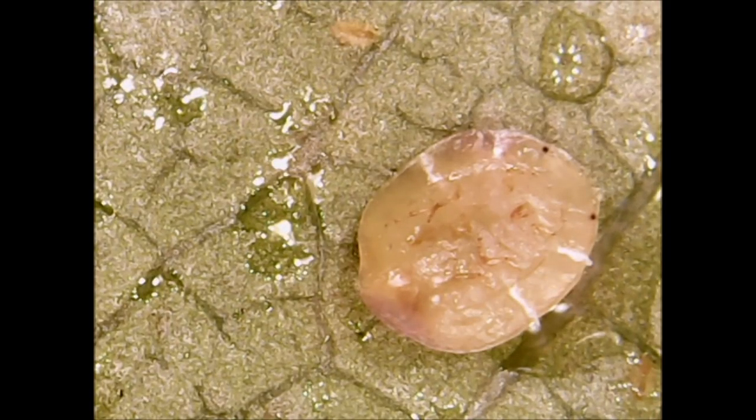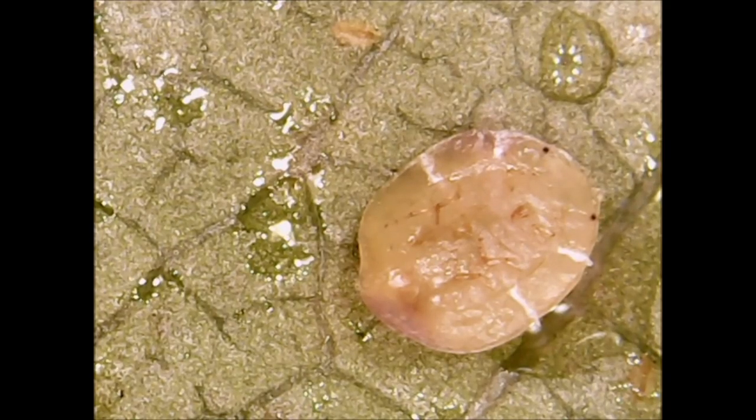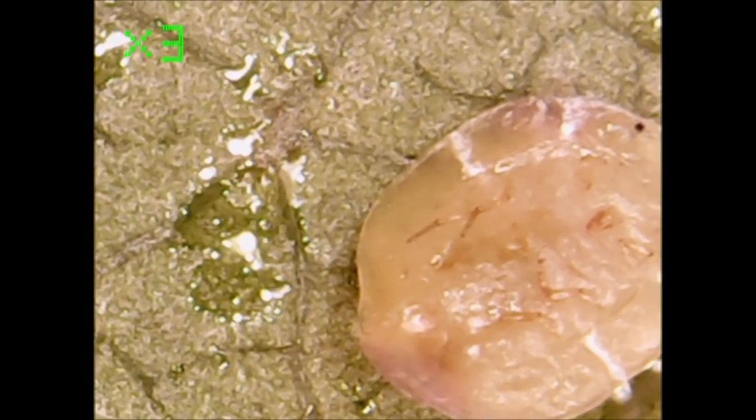Now you can see underneath it — this is the stomach area. You can see moving legs, you can see the eyeballs clearly, and you can see the mouth. The mouth is right in the middle of the two eyeballs, and back on the body behind the first legs. I never thought you would be able to see moving legs on scale — I never thought of scale as having legs. It's absolutely gross, not a pretty looking little animal at all. You got a good shot of the mouth right there — the sucking device that gets rid of all the nutrients out of the leaves, and the little legs that maneuver it. The legs are more for holding on than moving too much.